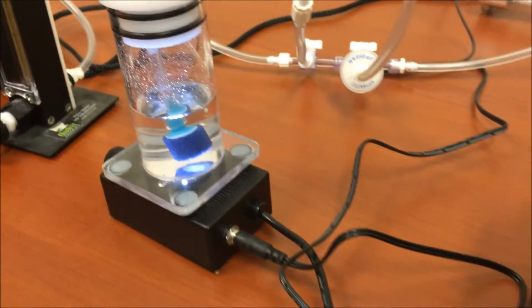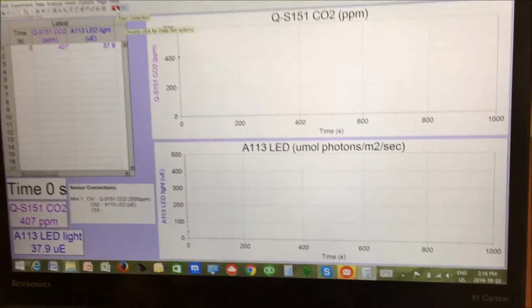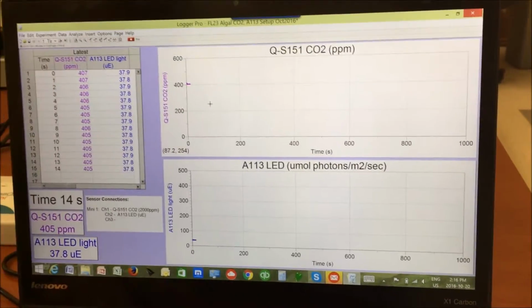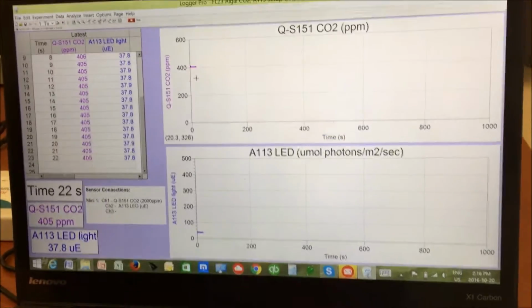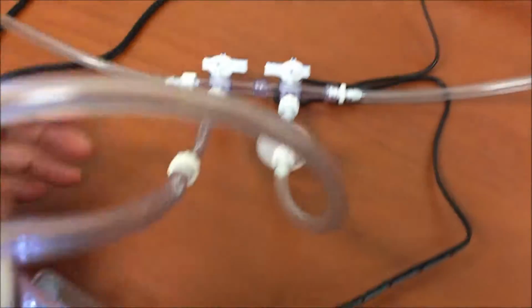When that is happening, you will start recording your experiment. You record by clicking here on the collect button, and all the data is going to start populating in the table, in the meters down below here, and on your graphs. So you can see that the data is being recorded. These are our reference levels of CO2, so whatever's in our gas bag. And when we obtain a sufficient reference, we would then turn these valves towards each other, which will allow the gas to flow now through our chamber.